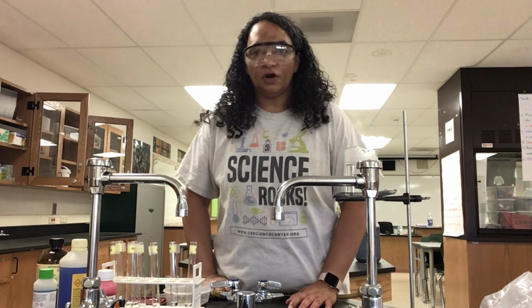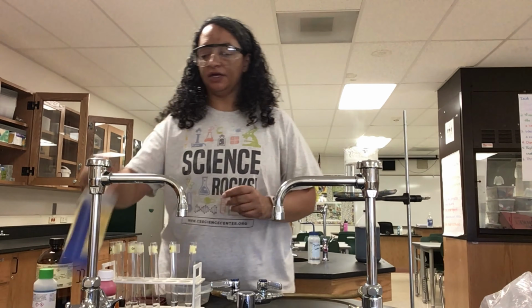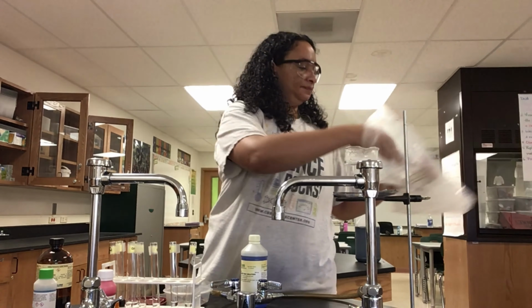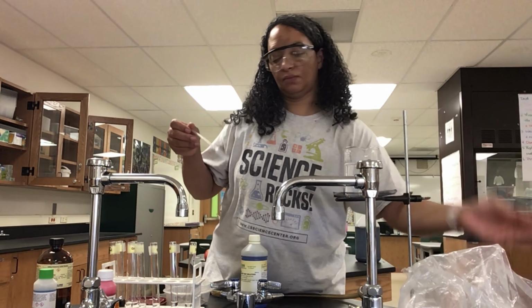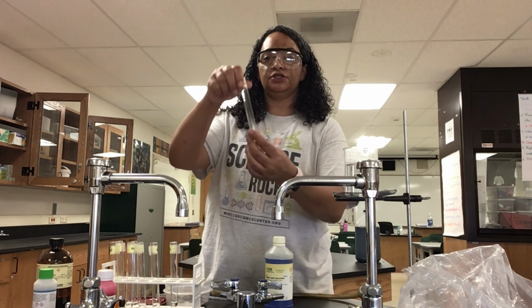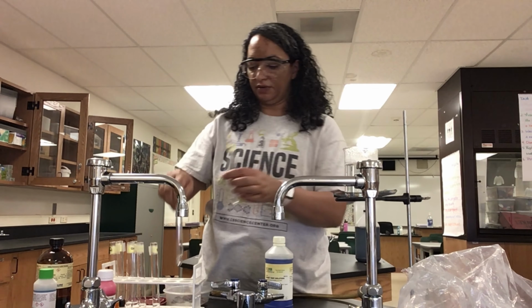All right, for our second test, we're going to go ahead and test for proteins. So I'm going to use my Biuret. Okay, so here's my Biuret. I'm going to grab a new pipetter. Okay, and I have 2 new test tubes. So I have my seed test tube with water in it, and I have my control test tube with water in it.